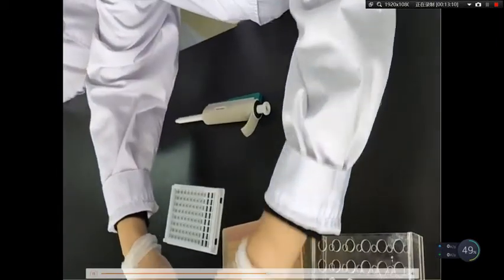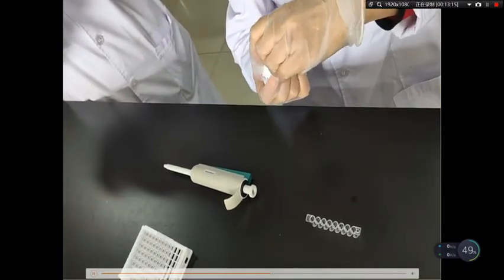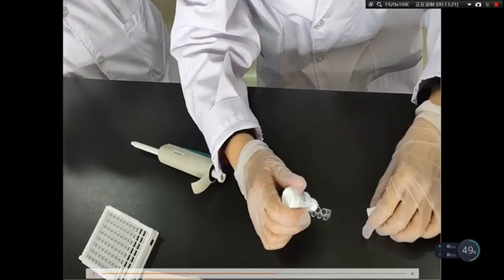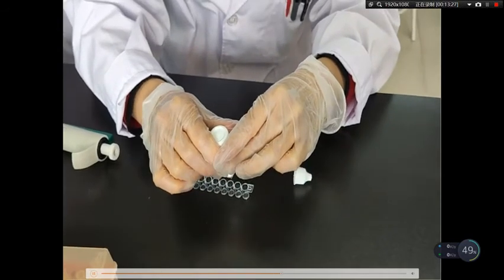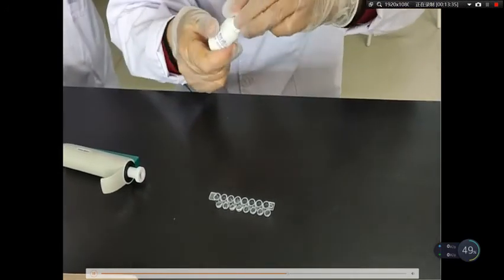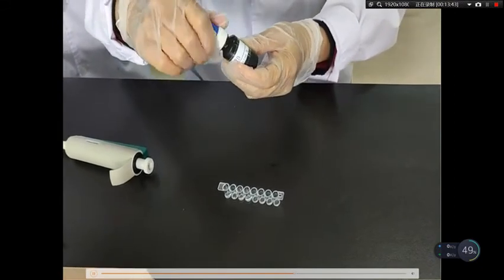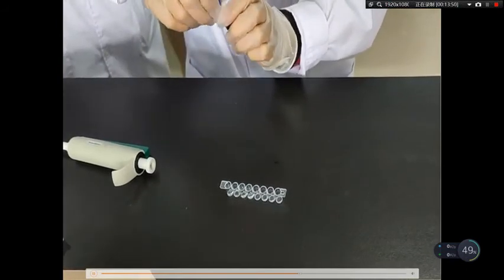After washing 3 times, we add the substrate. We have substrate A and B. First, we add substrate A, 1 drop per vial. Then we add substrate B in the same way, also 1 drop per vial.